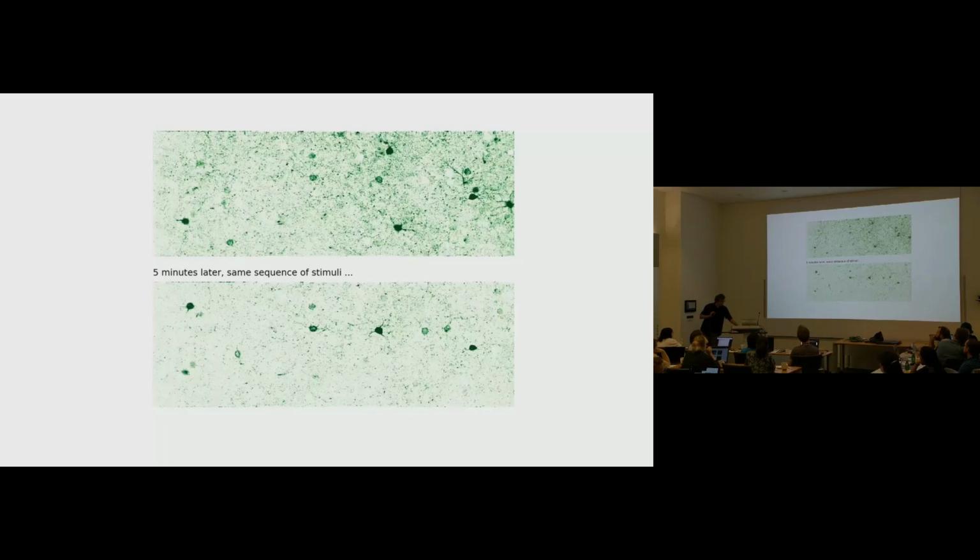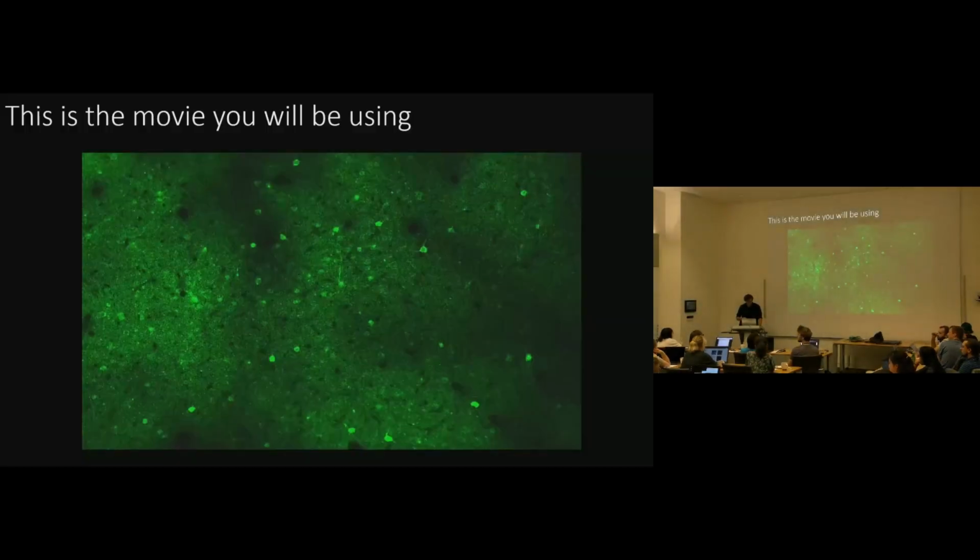We started with a more complicated approach that I'm not going to tell you about, but really the latest version of suite2p that this has evolved into is pretty much trying to mimic what we do when we look at these movies and say, something popped up, there's got to be a cell there. I'm just going to draw a little mask around it. It's doing almost just that. But the cell is not active at all. We'll talk about what to do in that case. Yes. Let's get to it.